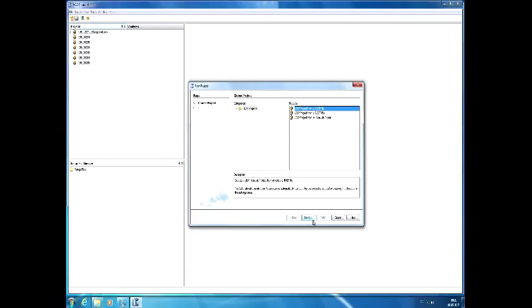Do not use a USB stick. If I find you with a USB stick on the atom probe, that's a lab ban. For obvious reasons. I think it's something that these days you shouldn't have to say, but I'm just saying it. Never ever use a USB stick on the atom probe. Okay.